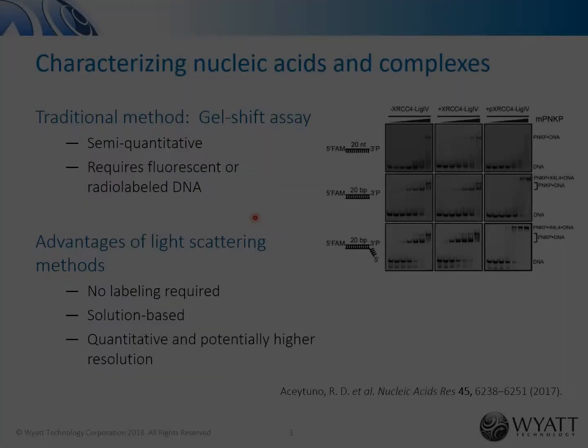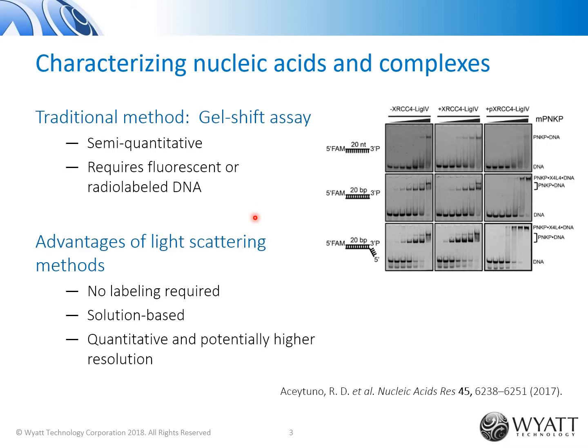Light scattering methods, on the other hand, provide absolute molar mass in solution. So there's no molar mass standard, there's no labeling required, and you can directly measure both the molar mass of your molecules and the interactions and the interaction strength between your oligos and their binding ligands.